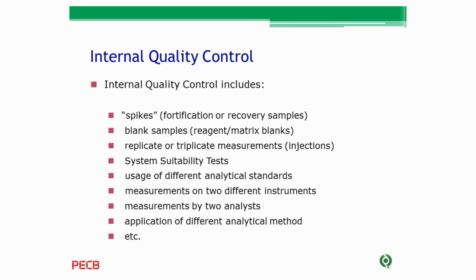Sometimes we repeat our measurements in order to see if our results are close together. Sometimes this closeness is mentioned in our test methods. It means that our test method provides criteria for us to see if our measurement repetitions are repeatable, and we can compare our repeatability with these criteria mentioned in the test methods.